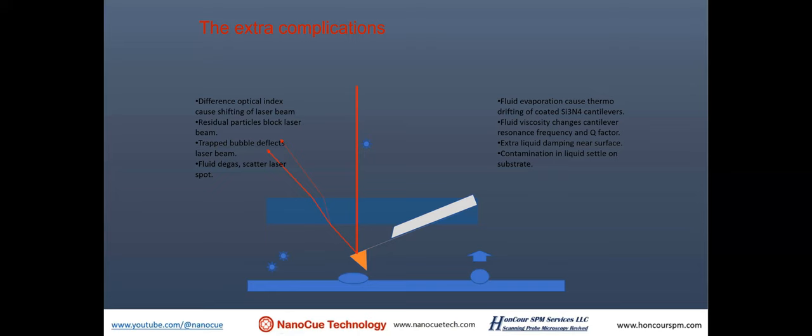So when we try to scan a sample in liquid, there's a lot of things that could happen compared to air imaging. You could be dealing with a different optical index of the liquid, and then you could deal with liquid that is not very clear. You have particles in liquid, and also when you have cold water that's saturated with dissolved air or nitrogen, you could observe some kind of bubbles. Fluid imaging also causes a little bit more complications in tapping mode oscillation, and the fluid could also evaporate fast. The viscosity of the fluid could also cause complications. So there's a lot of other things happening when we're imaging something in liquid.